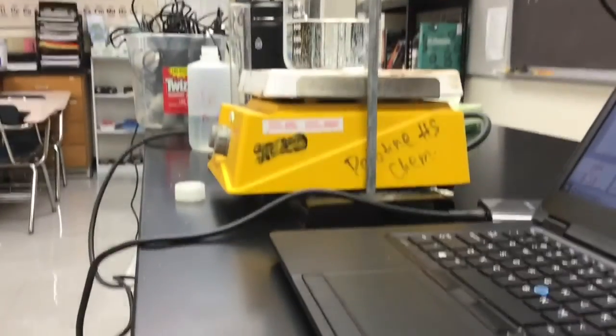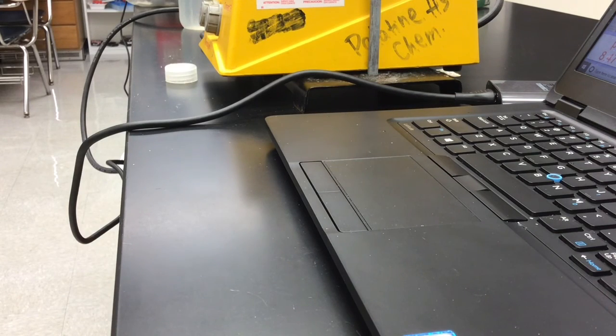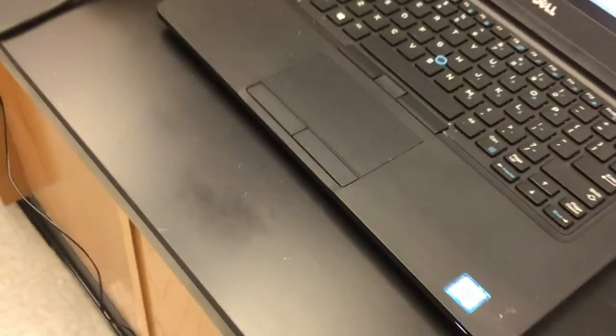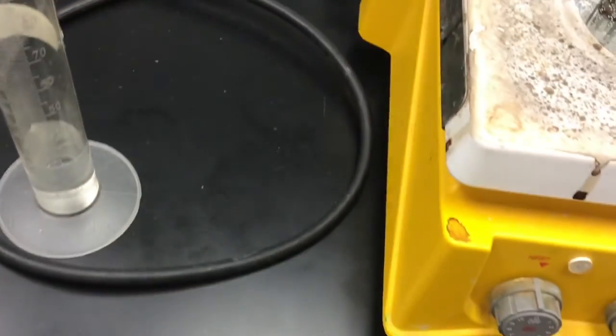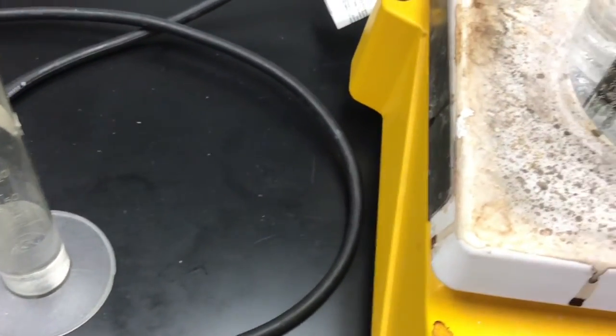The indicator that we're going to use is universal indicator, which I have right here. Universal indicator is cool because it's the colors of the rainbow, starting at about a pH of 4 and going up to a pH of about 10. It's Roy G. Biv, with green being the middle pH, so that's a pH of 7.